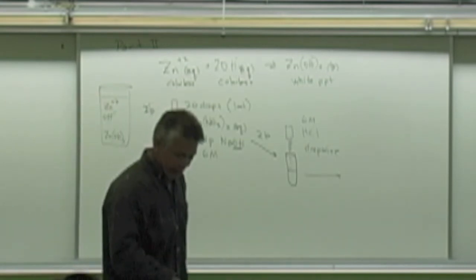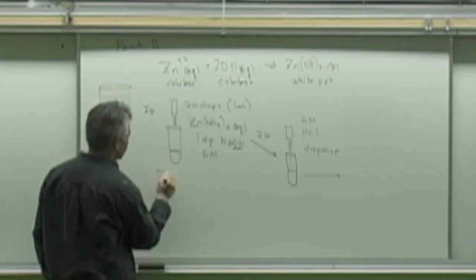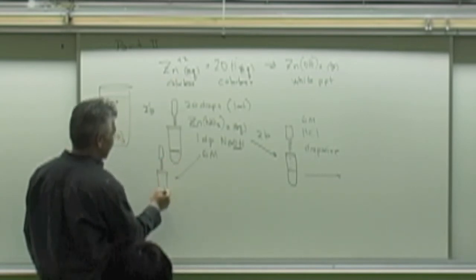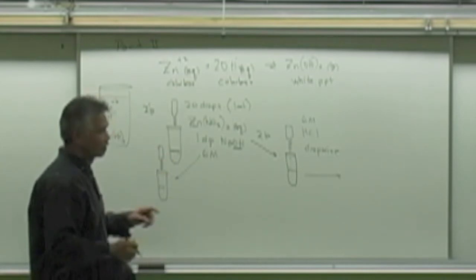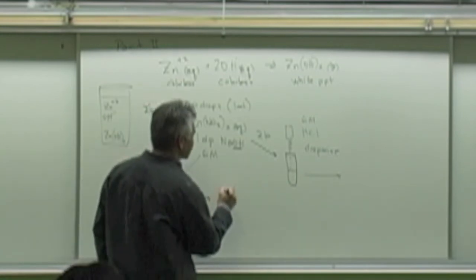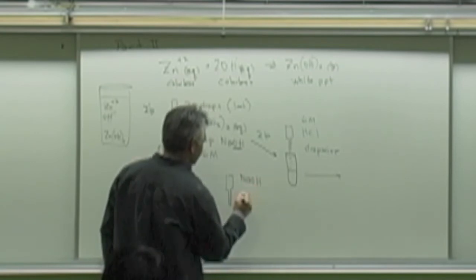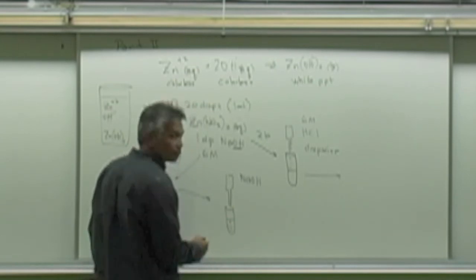Okay? The next step is to prepare a second solution. In fact, do 2 of these in the beginning, where you take some zinc nitrate and you add 1 drop of sodium hydroxide. So you have 2 test tubes of this. To one of them you add hydrochloric acid. To the second one you add sodium hydroxide. So you take that test tube with a Beral pipette, and you add additional sodium hydroxide until you see, again, a change in here.